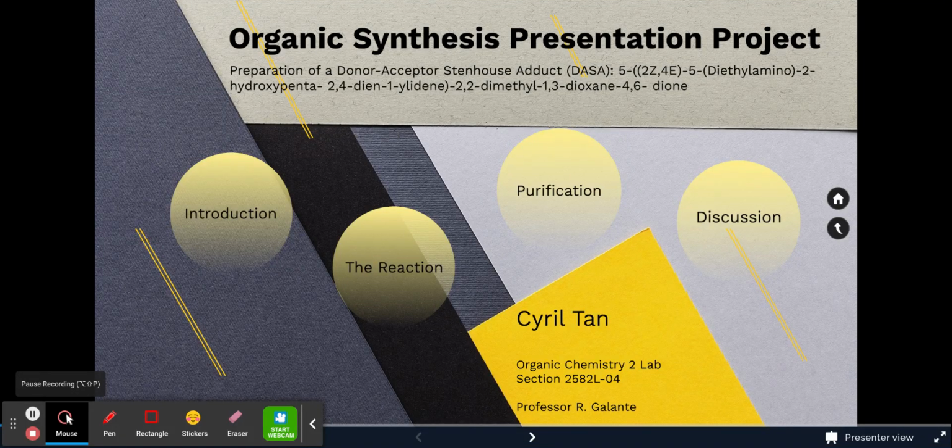Hi, everybody. Welcome to my organic synthesis presentation project. I'll be discussing the preparation of a donor acceptor Stenhouse adduct, or DASA for short. So let's get started with a little introduction about DASA.